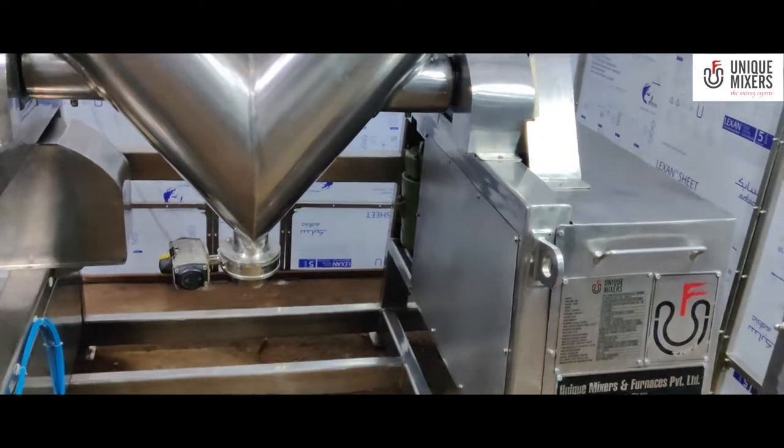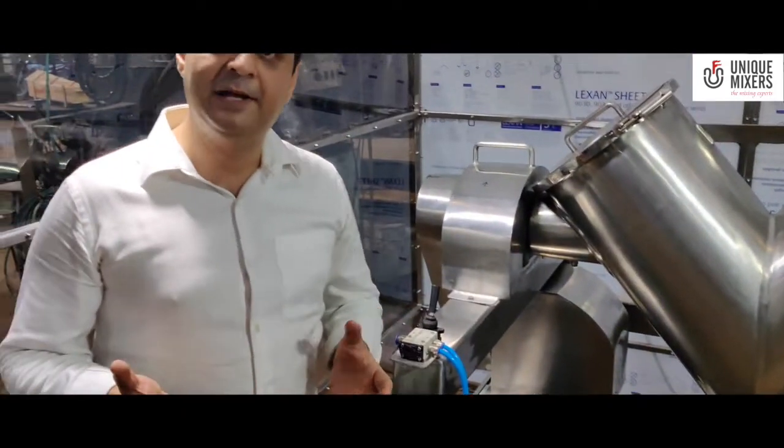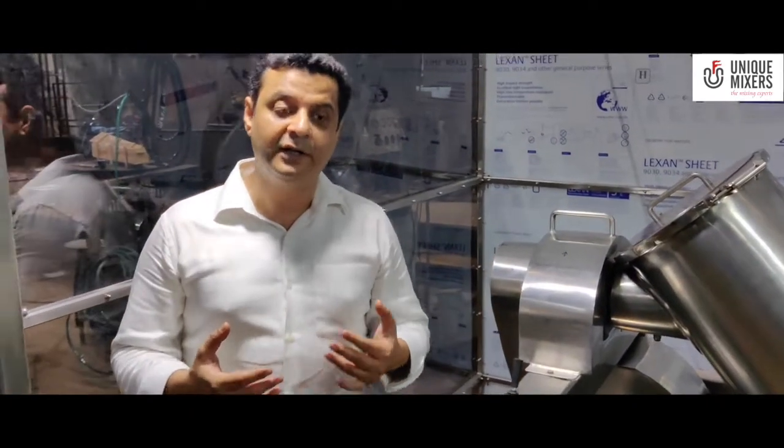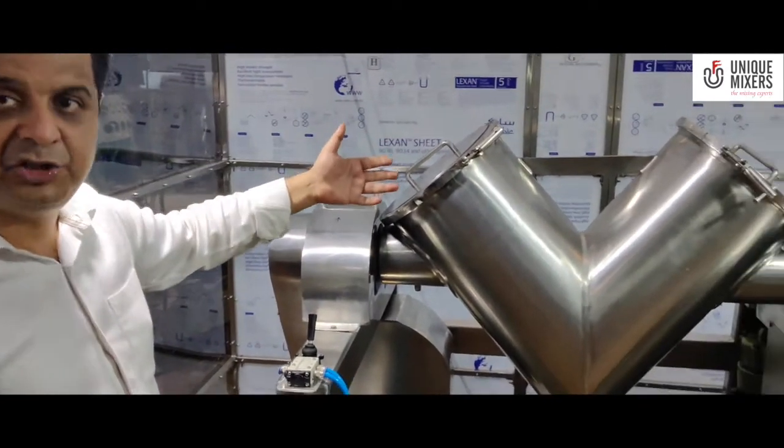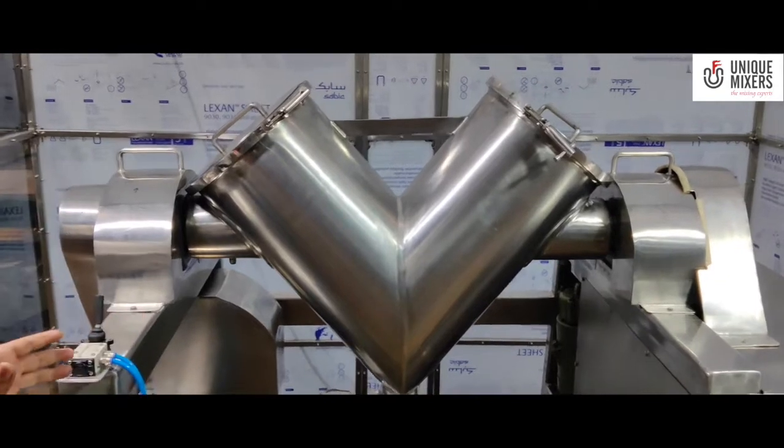So the V-blender primarily is a diffusion type of blender. It works on the principle of diffusion blending, and by the rotation of the shell there is a repeated converging and diverging action.